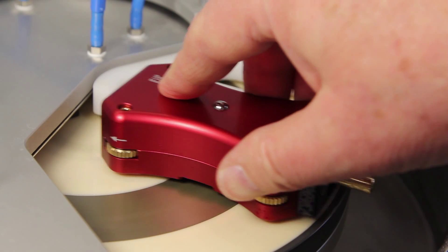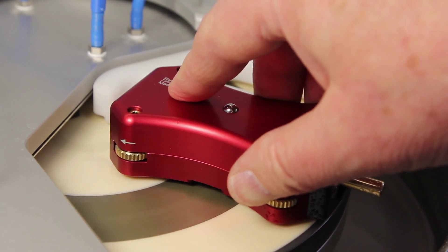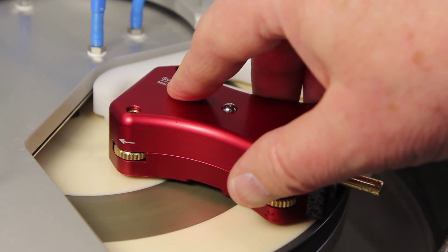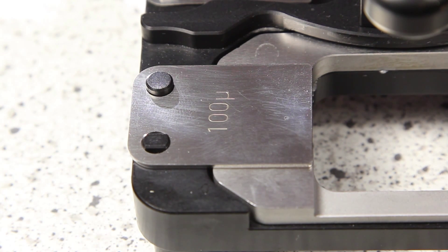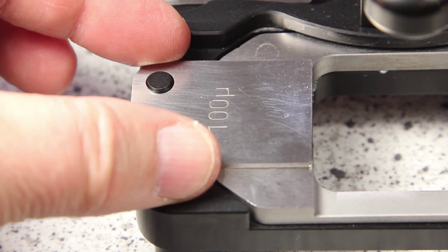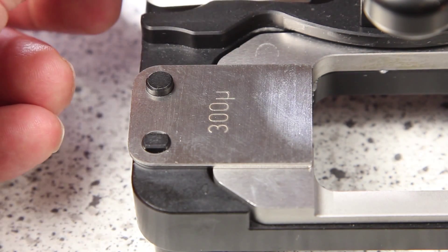Here it's ready. Now it has 1.4 millimeters. As you remember we have 1400 microns at the setting device. Now we change to 1300, that means I take 100 away.